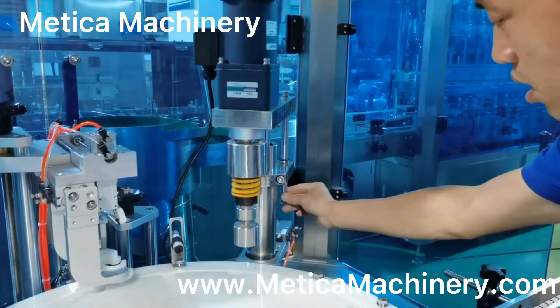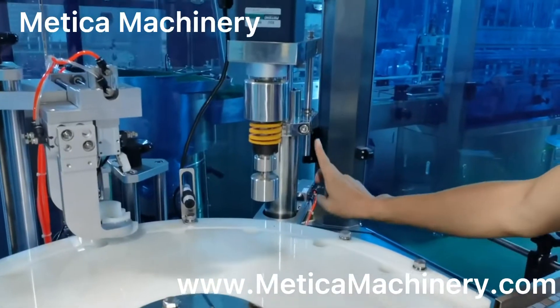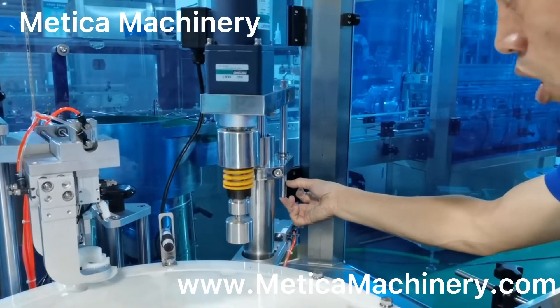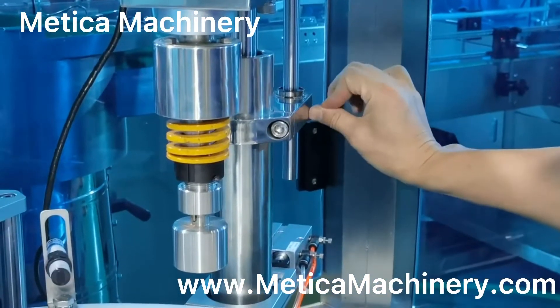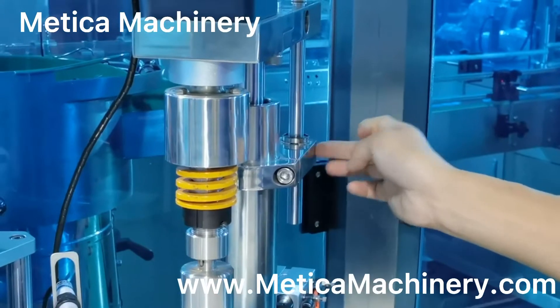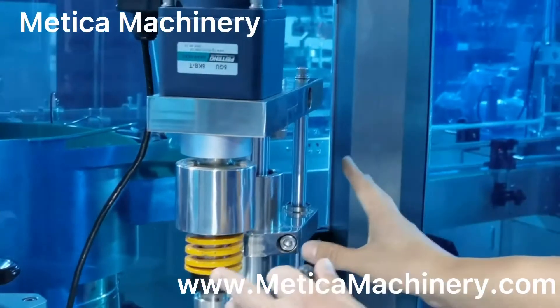Be careful when you check this one — when it moves here, make sure this part always has extra clearance, not going into this other part. If it gets into that part, it will be a problem over time. That is the adjustment for this.